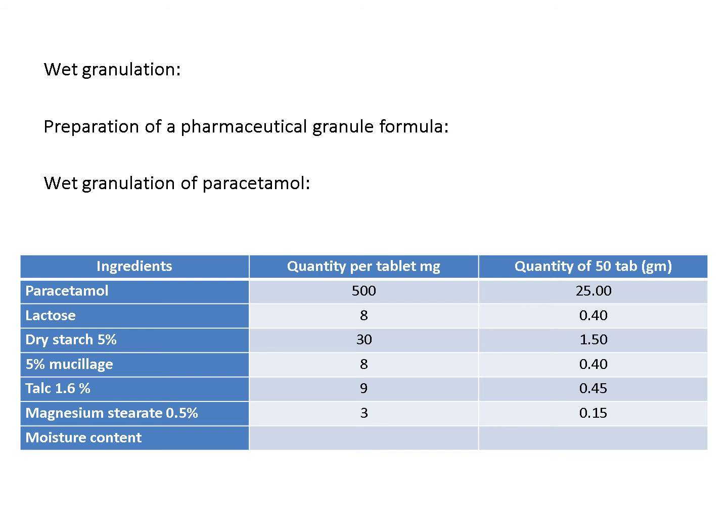So what we really have to add: we will add lactose as a diluent, but in a very small amount. 8 milligram per 1 tablet, multiplied by 50 and divided by 1000, will be 0.4 grams for the whole 50 tablets. I can really omit lactose as a diluent, because the purpose of a diluent is to enlarge the bulkiness of the powder and the tablet.